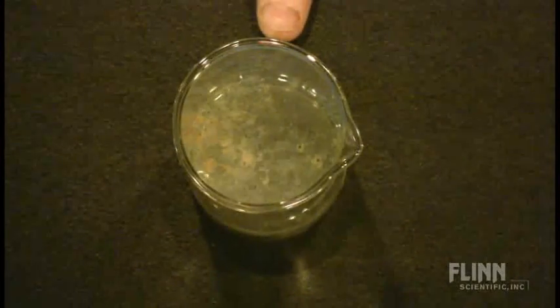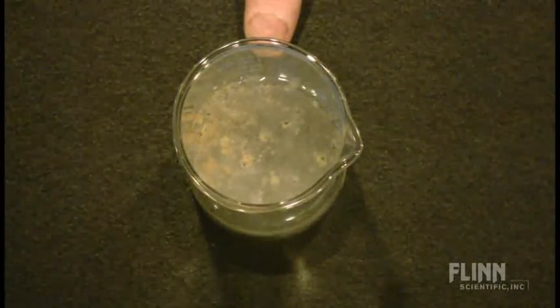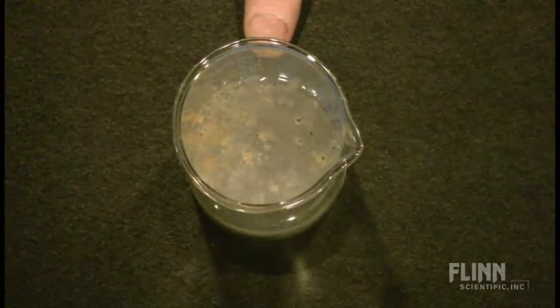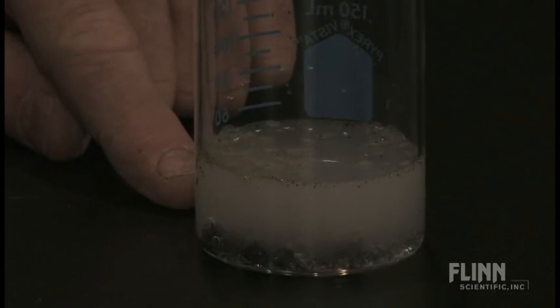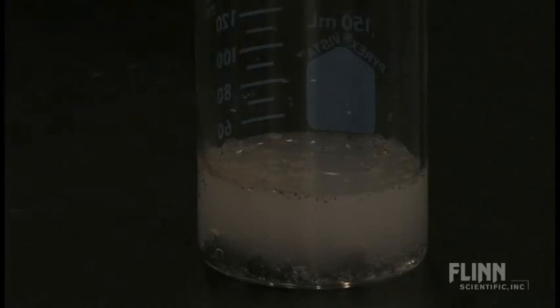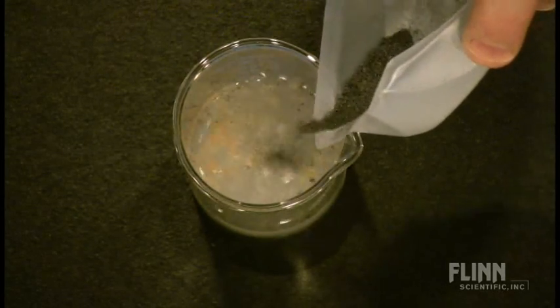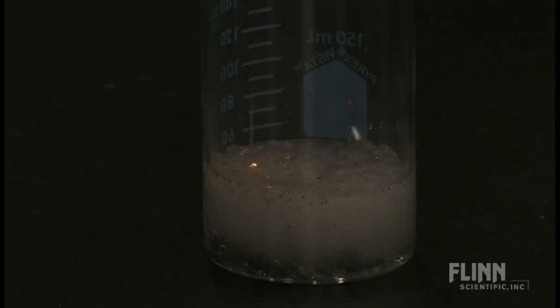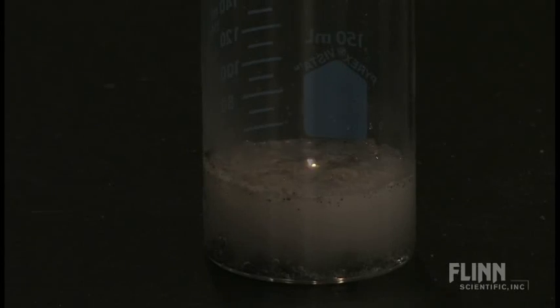The bubbles that are being produced in there are silane. They're rising to the surface and they're hitting the air. The SiH4, when it hits the air, spontaneously combusts, and so it catches on fire. You can hear the popping noise and you can see the little flashes as the silane spontaneously combusts in the air.